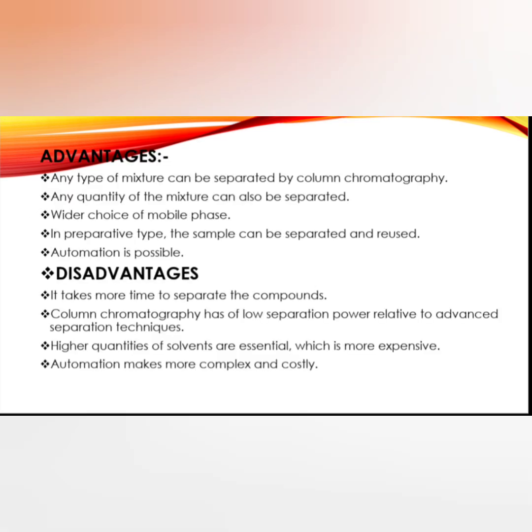And next one is advantages. Any type of mixture can be separated by column chromatography. A large quantity of the mixture can also be separated. Wider choice of mobile phase. In the preparative type, the sample can be separated and reused, and automation is possible.